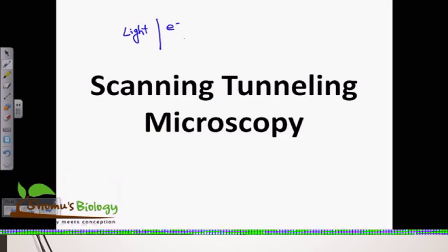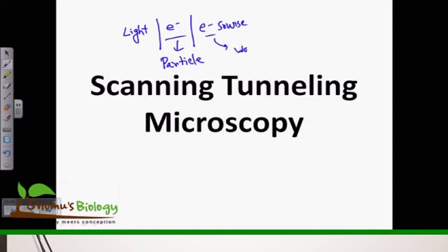Now in scanning tunneling microscopy, we are also using electron as a source, but remember, the electron that we use in electron microscopy behaves like a particle, just like the classical phenomena of physics. But the electron that we use in scanning tunneling microscopy behaves like a wave.